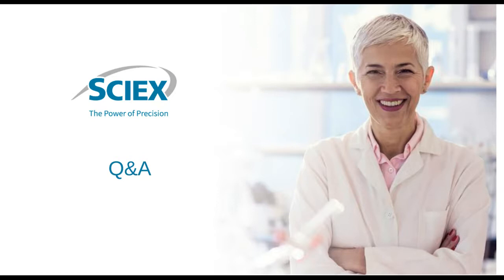Great, thanks, Christian. The next question, is the sensitivity of ZipChip MS comparable to LCMS in terms of targeted quantitation? I guess that's a related question then. That's really related to this one, yeah. I can say yes. The difference is that the concentration for the ZipChip samples have to be a little bit higher because you can only inject a few nanoliters in the system. But if you look at the overall amount you put on the column or on the capillary here, it's really comparable.